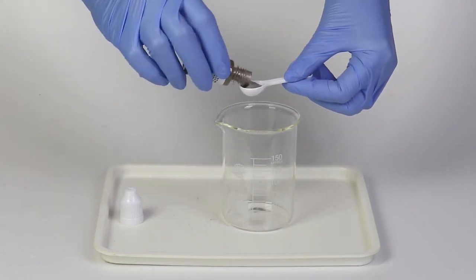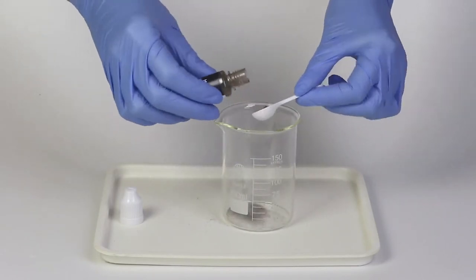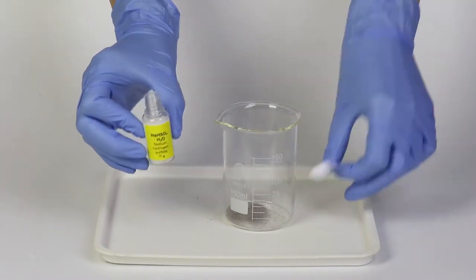Add two big spoonfuls of this mixture to the beaker. Next, add two big spoonfuls of Sodium Hydrogen Sulfate.